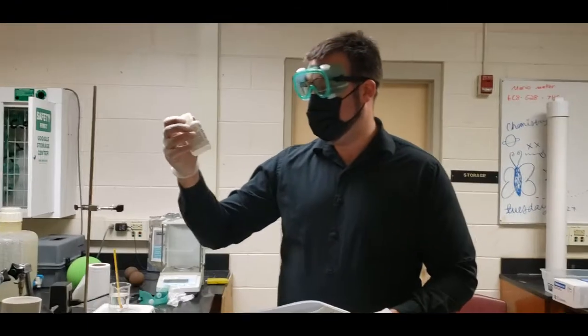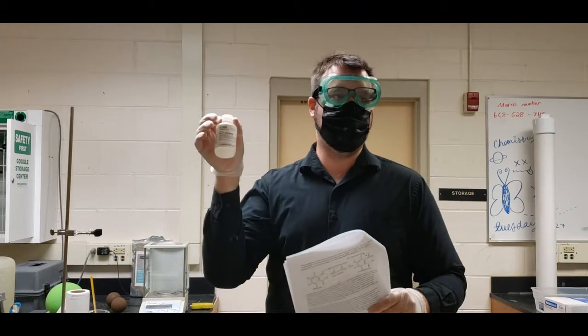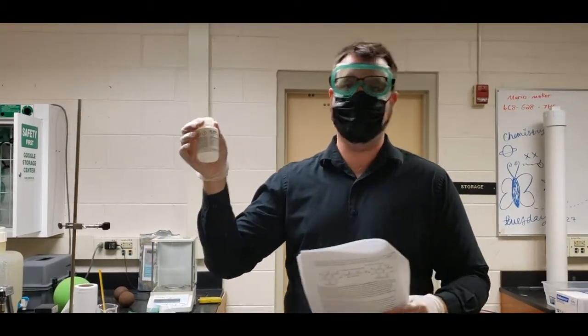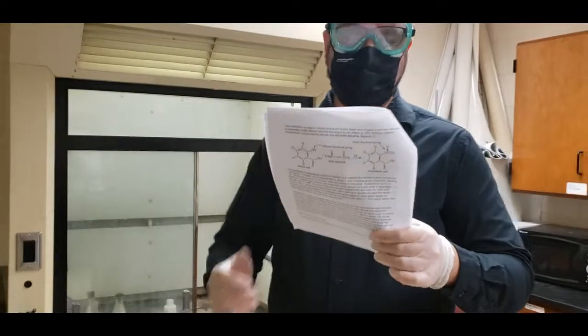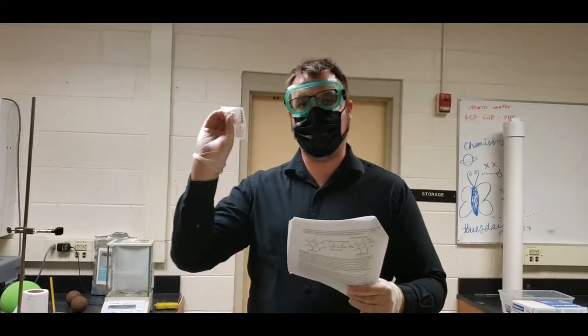The first material in our list is the acetic anhydride. We should remember from our pre-lab that this is a lacrimator, which means that it will make you cry. So, lacrimators are going to go into the fume hood. The next is that we have our crushed aspirin that can stay at our table. This is going to be what we use for our reference point for our melting point.